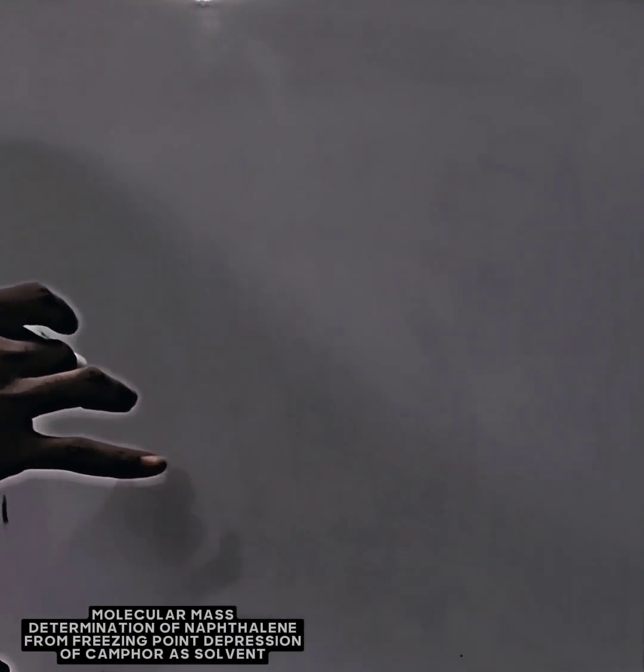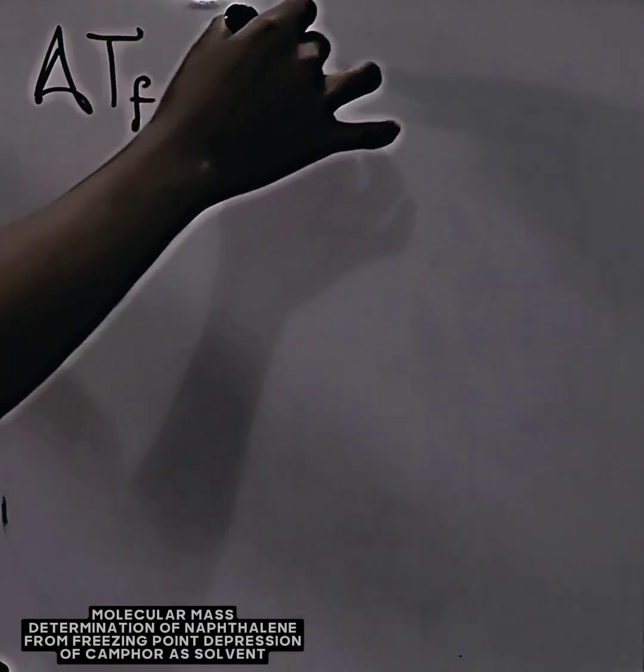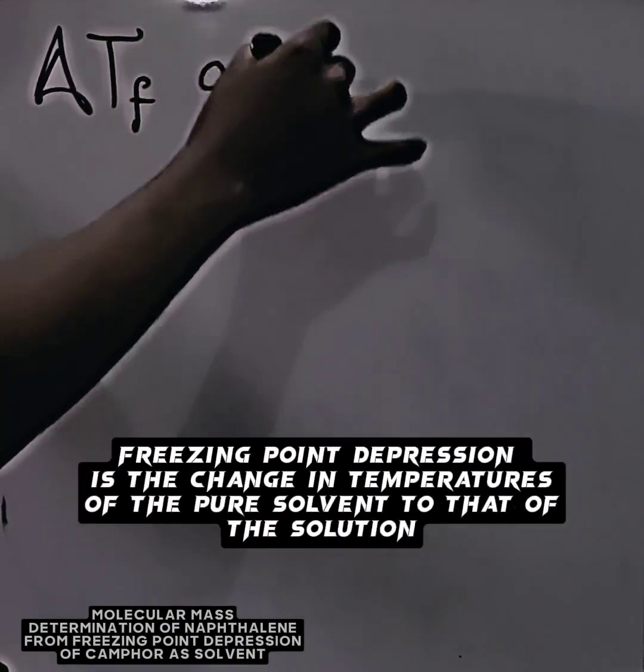Now, since we've been able to establish for a fact that freezing point depression is a colligative property, it is essential for you to know that the magnitude of the freezing point depression, let me use this as the symbol for freezing point depression, ΔTf, is directly proportional to the molality of the solution.